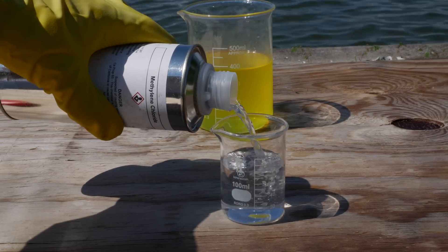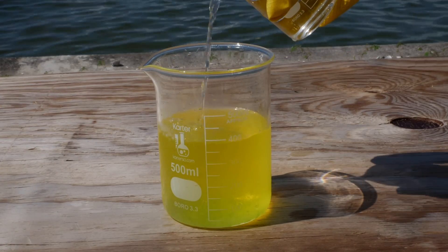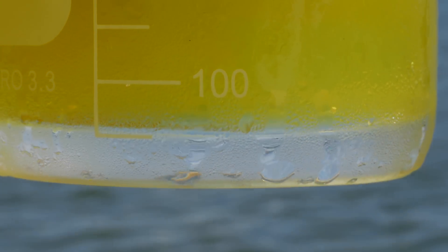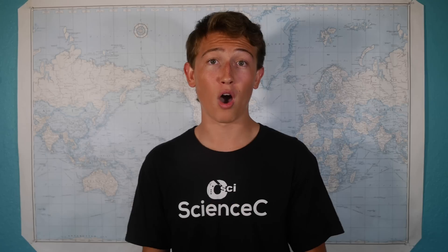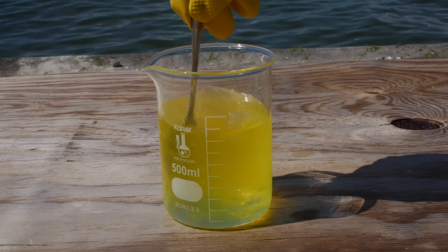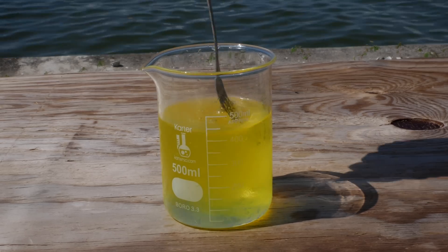Our first step is going to be mixing that methylene chloride with the Mountain Dew. Methylene chloride is immiscible in water, meaning that they won't mix and go into solution, just like oil and water. And while caffeine is soluble in water, it's a lot more soluble in the methylene chloride. So now, we give our toxic concoction a good mix so that caffeine gets dissolved in the methylene chloride.